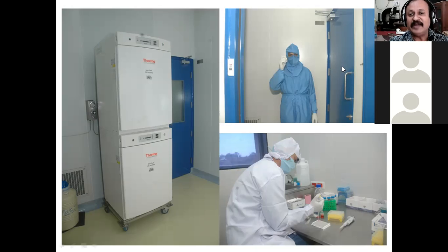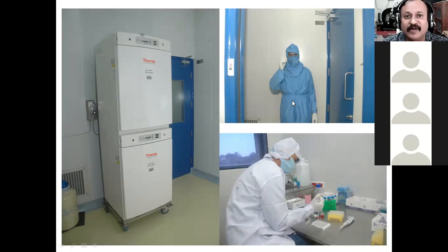Now, when he enters this first door, in this particular small space here, he is supposed to wear the sterile clothes. So what he is wearing here, can you see that? It is a pullover gown, a one-piece gown. It is not a two-piece attire, but a one-piece gown which is autoclaved, which is sterilized. So after he wears that, only then he can enter through the second door and come inside.